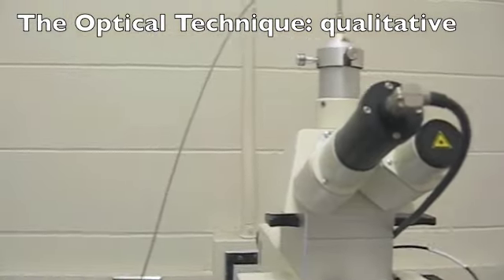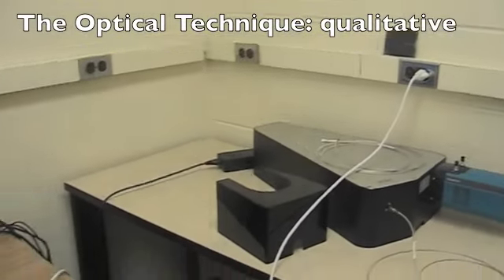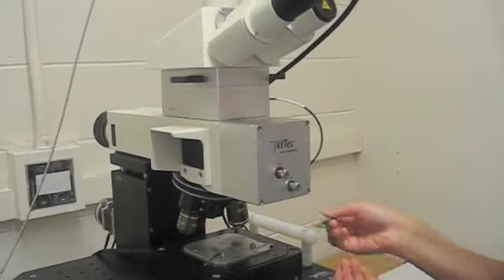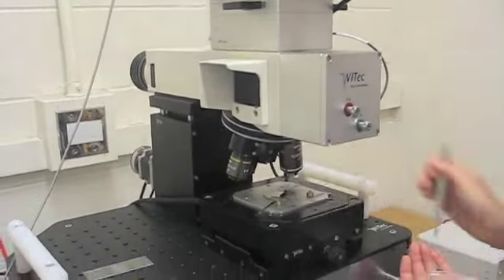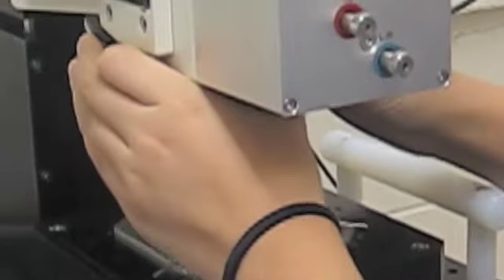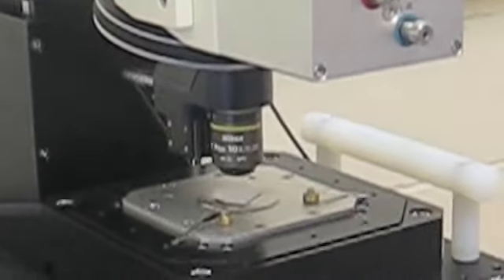In order to qualitatively determine the location of the graphene, you can use an optical microscope. The lens in this microscope has a magnification power of 100. Once you place a silicon wafer under the scope, you can hunt for the graphene as if you're searching for an island in the sea.